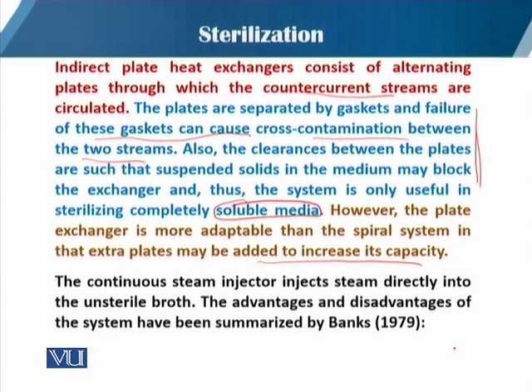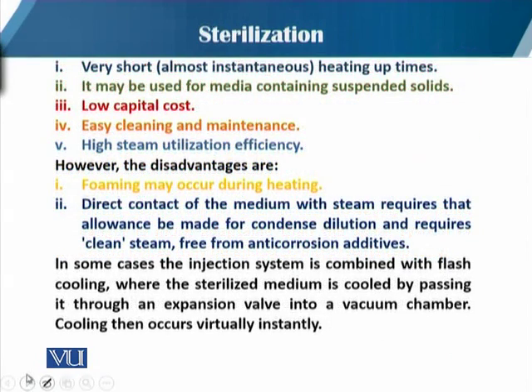The advantages and disadvantages of this system were summarized by Banks in 1979. As far as the time is concerned, this method is very short. It can be utilized almost instantaneously, and the heating up time is less. So it may be used for media containing suspended solids. Compared to the previous method, it involves a low capital cost, easy cleaning and maintenance, and high steam utilization efficiency.